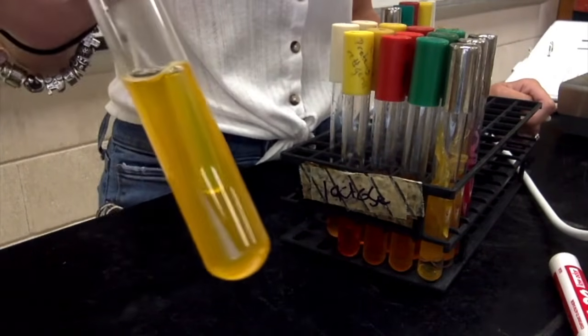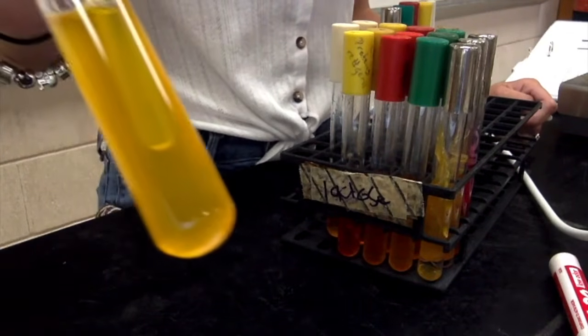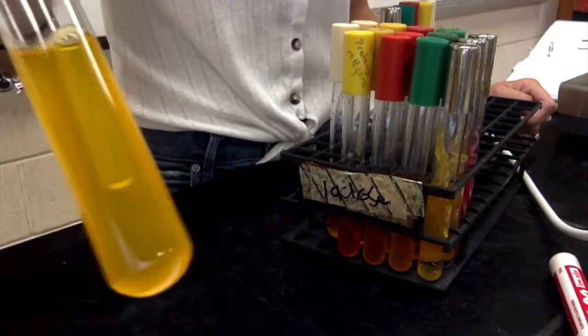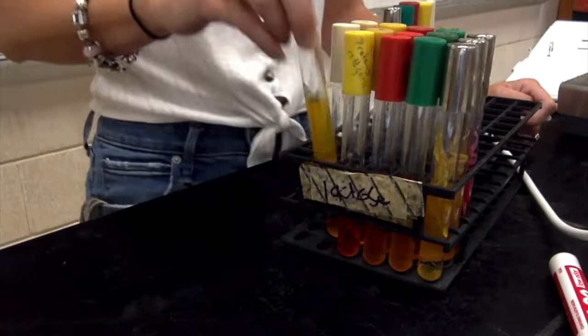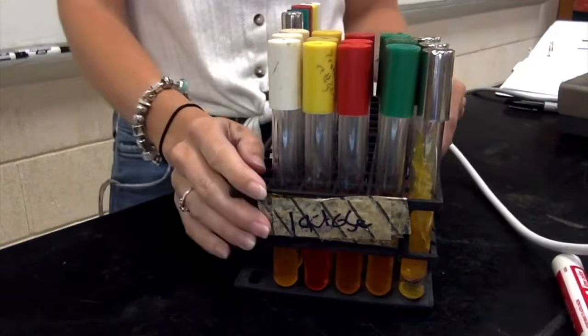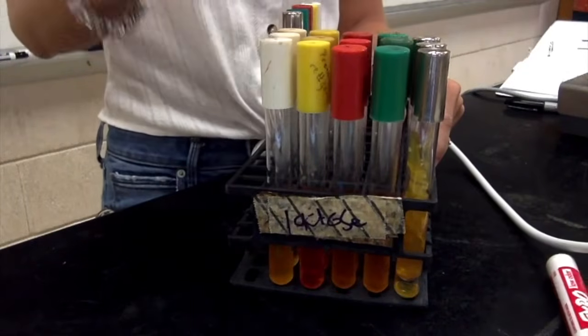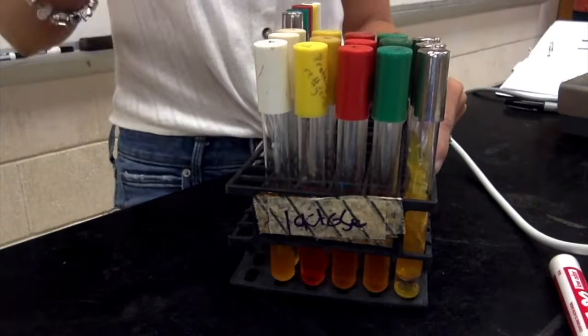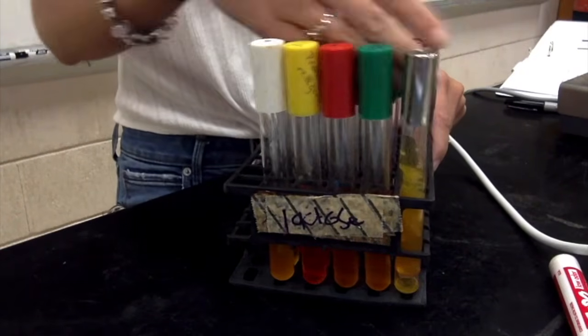And lastly, our mannitol. Nice bright yellow tube, and look at that big old gas bubble. So it's positive for fermentation, positive for gas. So the pattern that E. coli shows for our four sugars is positive, positive, negative, positive, with all the positives having gas. So that's E. coli.